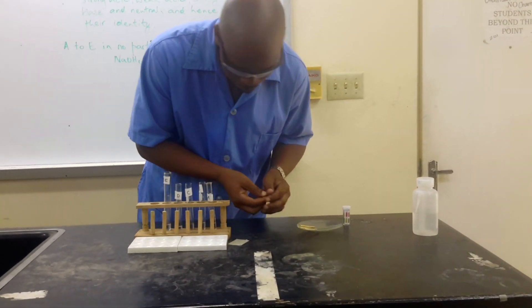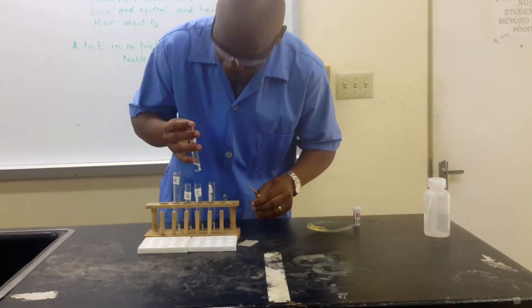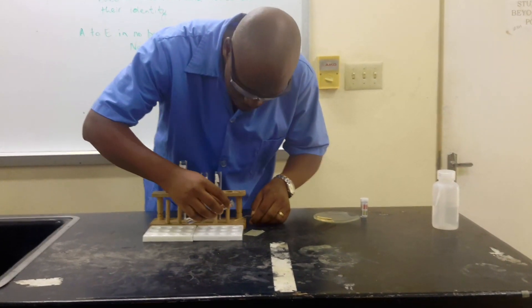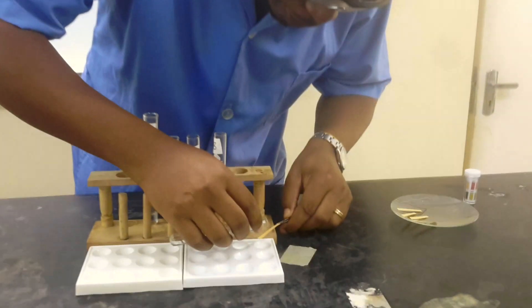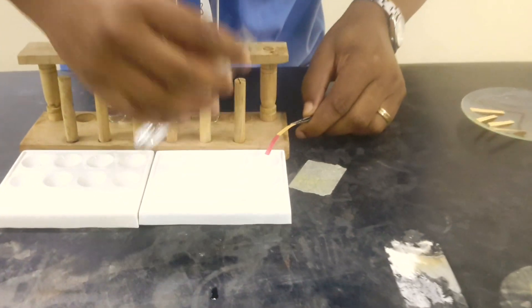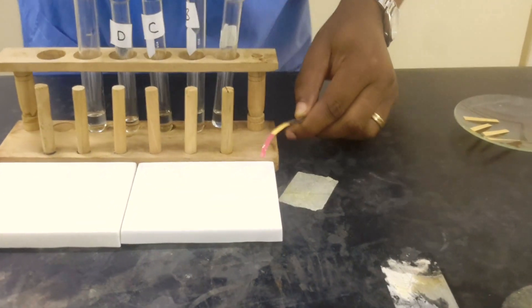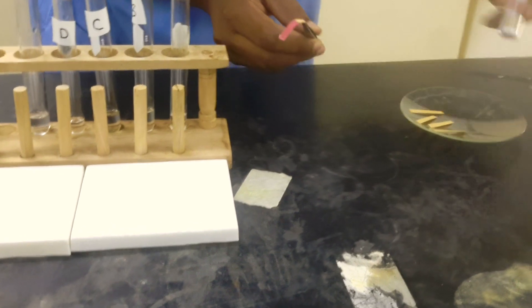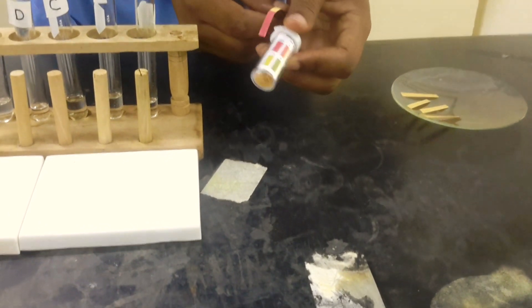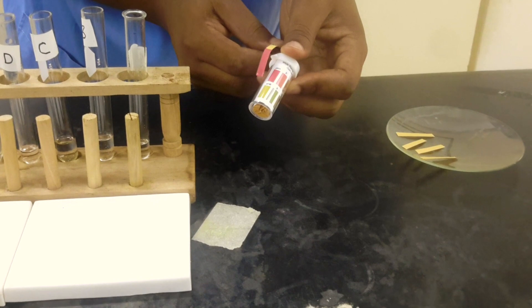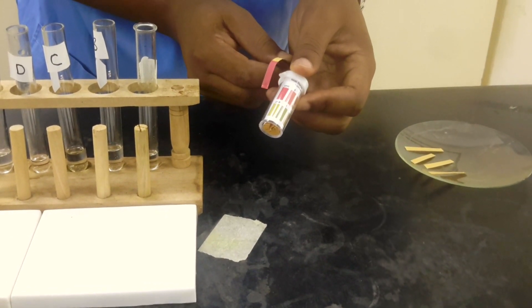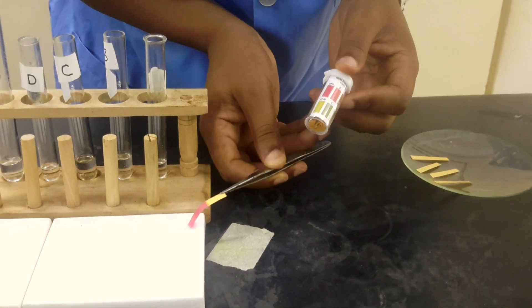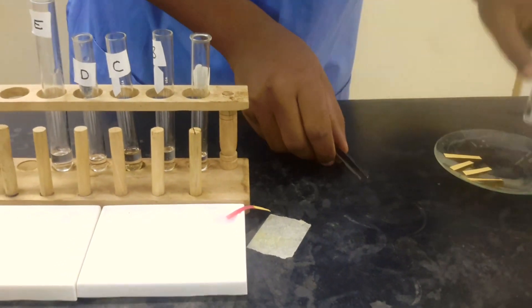We'll just take solution A and pour it onto our universal indicator paper. We'll get a color change, so we'll just take the sheet and match. The color here is corresponding with pH 1 based on that color, so we can just leave that one right there.